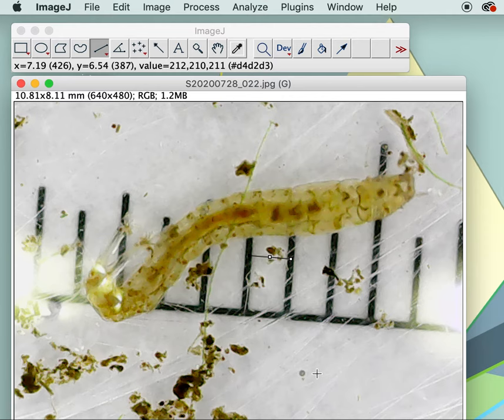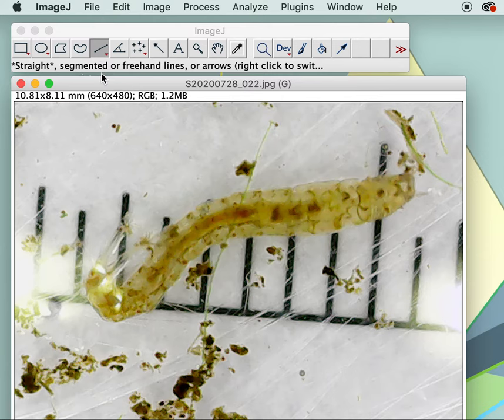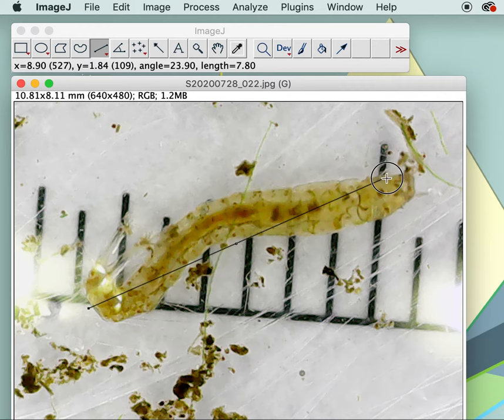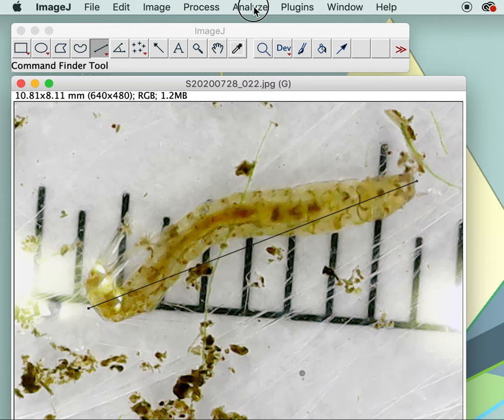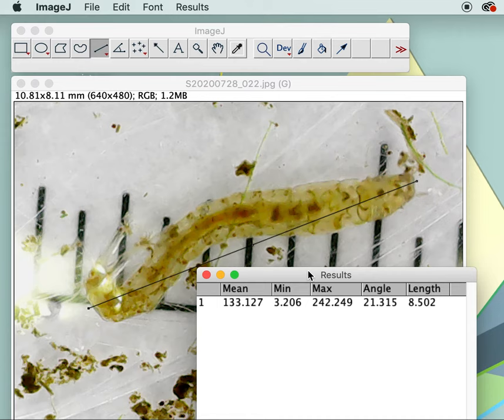Notice once I click away the line disappears. Now I want to measure the length of my midge fly larva, so I keep with the straight line tool and do the best I can to make a line. My midge fly is not straight, but I'll show you a more accurate way in a minute. I go to Analyze > Measure and a little box pops up telling me the length is 8.5 millimeters.